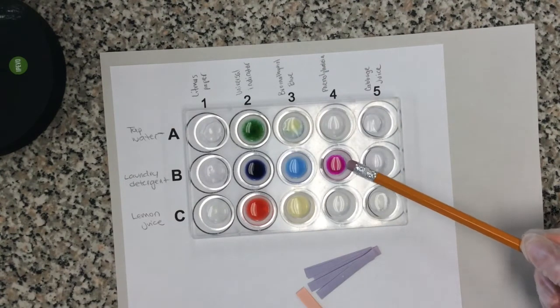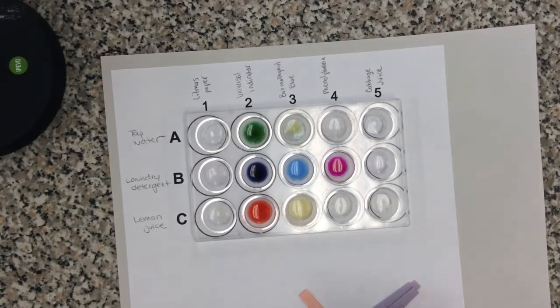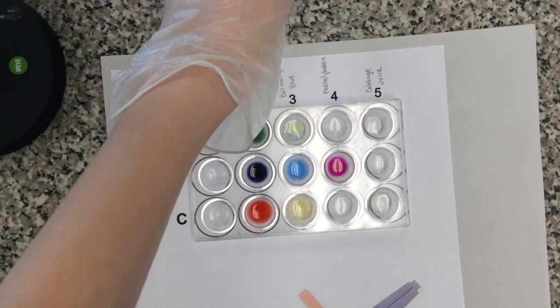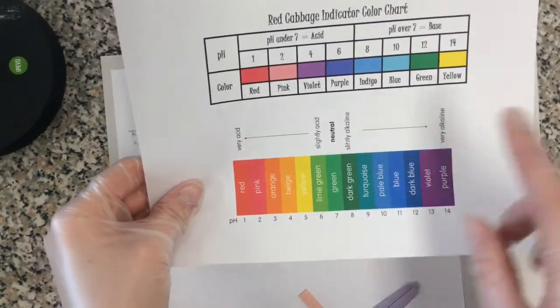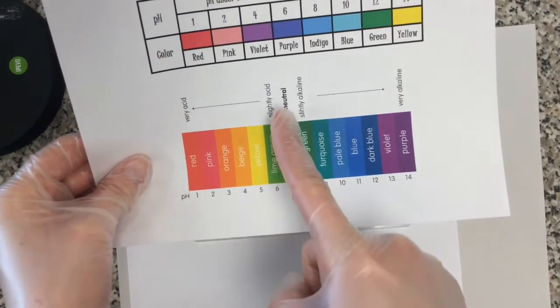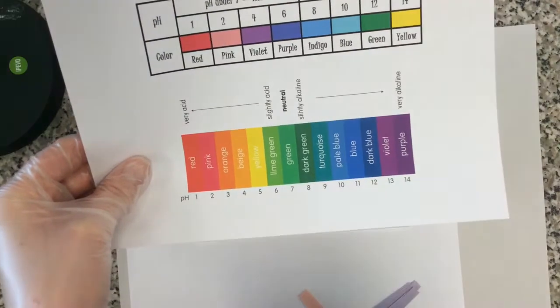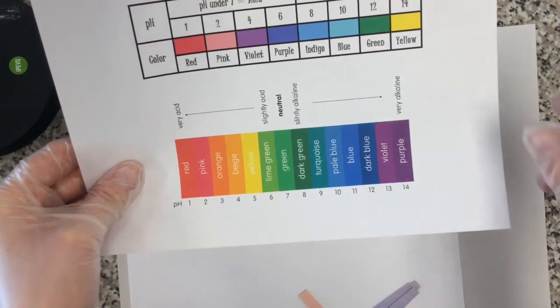You have your information right here as to what color and what pH it is. And the last one we're going to do is our cabbage juice. So I've got my cabbage juice right here. And cabbage juice is kind of like universal indicator. It gives you a color for almost every pH level, right? Universal indicator has the most color options. It gives you the most accurate results. You not only know if it's an acid, a base, or neutral, but you also know, based on the color, what the specific pH is, which can be really handy.